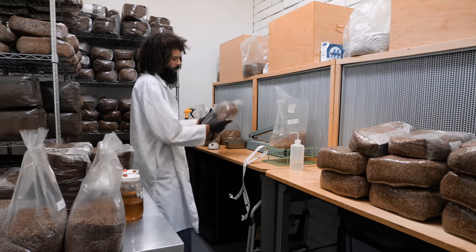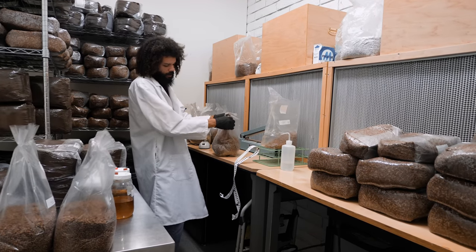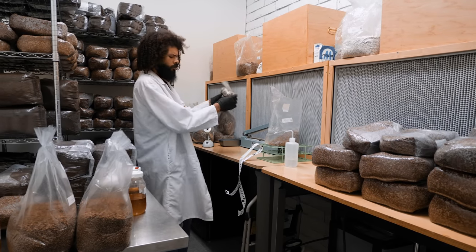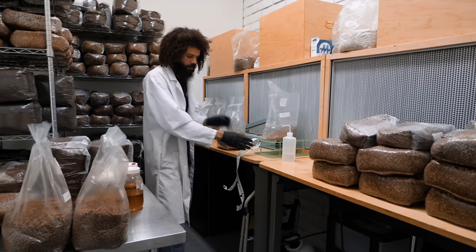But as you start to scale up and want to produce more, you want to use larger containers. The glove box just doesn't really work as well — it's just not feasible at that scale.